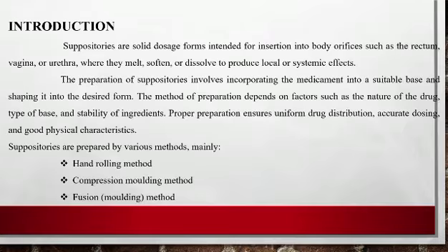Preparation mainly involves incorporating the medicament into a suitable base and shaping it into a desired form. Proper preparation ensures uniform drug distribution, accurate dosing, and good physical characteristics.